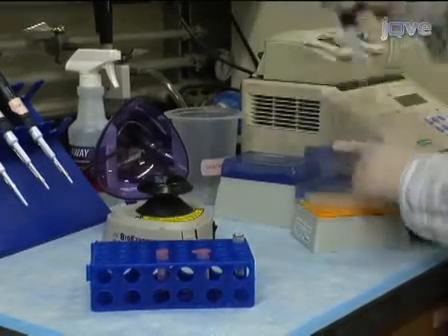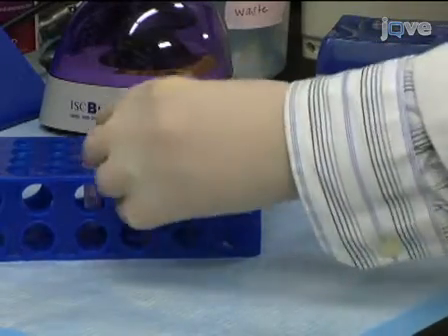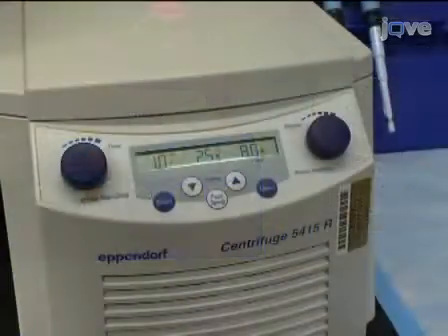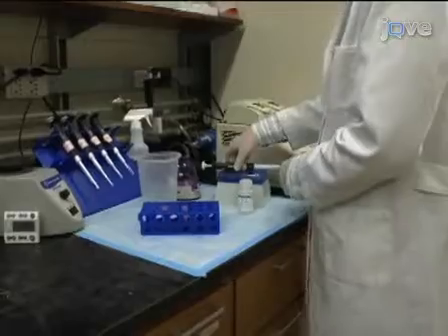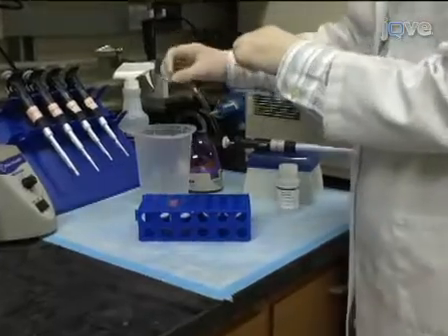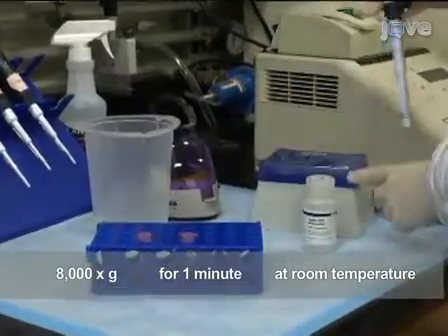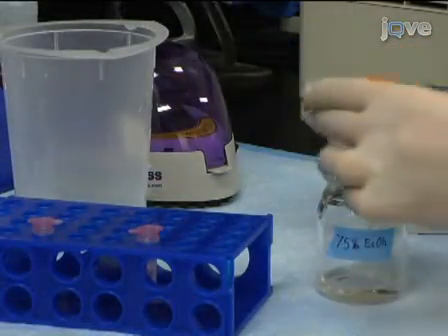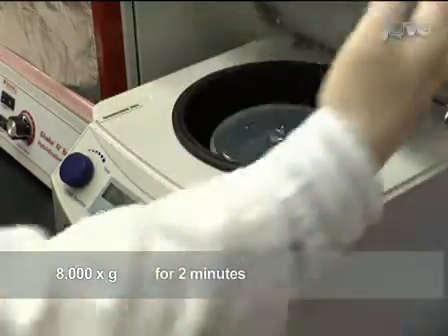Incubate the DNase treatment for 30 minutes at room temperature, then add 350 microliters of buffer RW1 to the spin column. Centrifuge at 8,000 g for 1 minute at room temperature. Discard the flow-through and add 500 microliters of buffer RPE to the spin column. Incubate the sample for 5 minutes at room temperature, then centrifuge again at 8,000 g for 1 minute. Discard the flow-through and add 500 microliters of 75% ethanol to the spin column. Repeat centrifugation at 8,000 g for 2 minutes at room temperature.